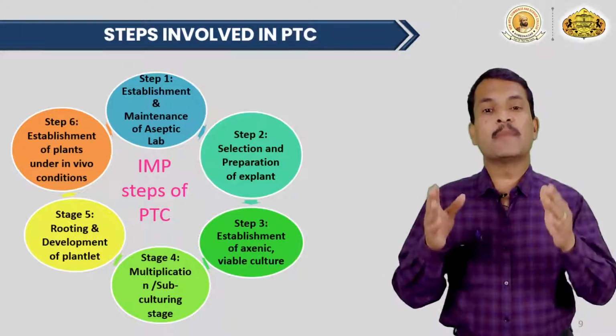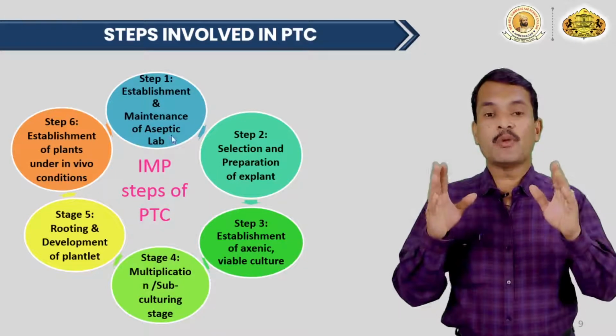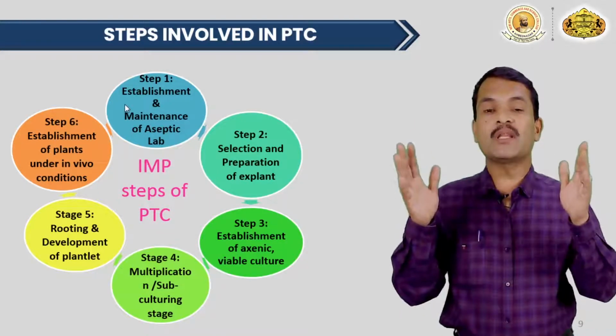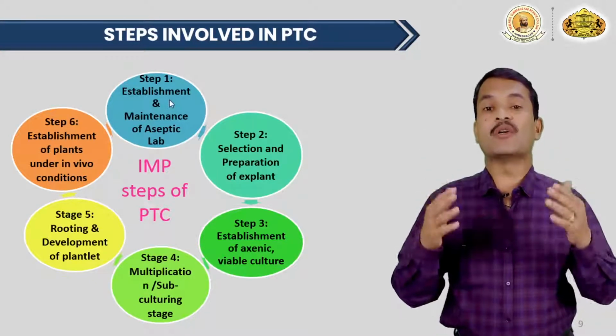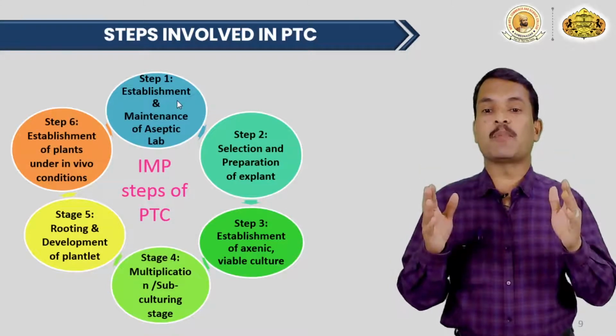The first step is the establishment and maintenance of an aseptic lab. If you don't have a laboratory, you need to set up a laboratory. So that will be the first thing. Or if the laboratory is there, you need to arrange or rearrange the laboratory as per one's need. So that is the very important thing.